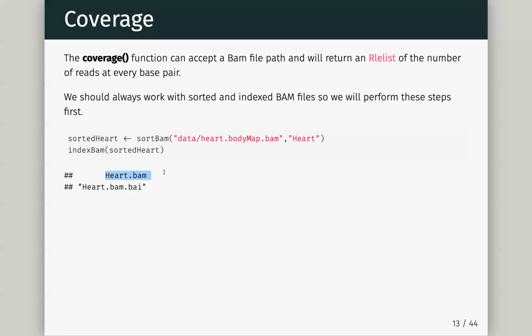This is a named vector. This is the value of the binary index. And the name of that index in our vector is the name of the file we created the index from.